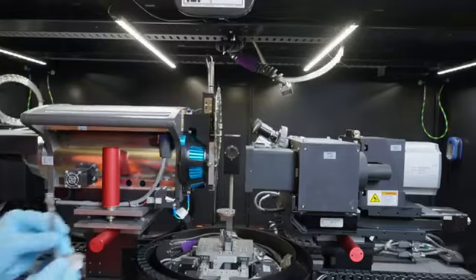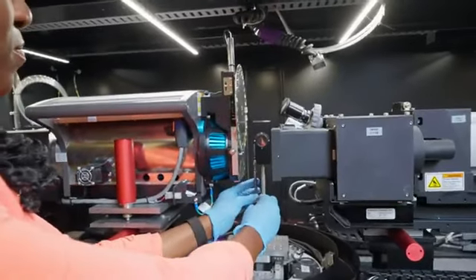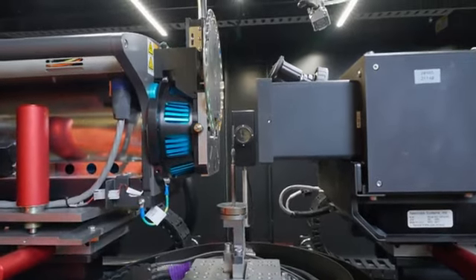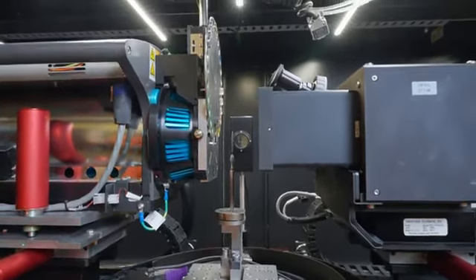So right behind me, we actually have the X-Radia Versa 520. It is a laboratory-based X-ray microscope produced by Zeiss. This is a very powerful 3D imaging tool that can probe the internal structure of materials down to 700 nanometers of spatial resolution in 3 dimensions.